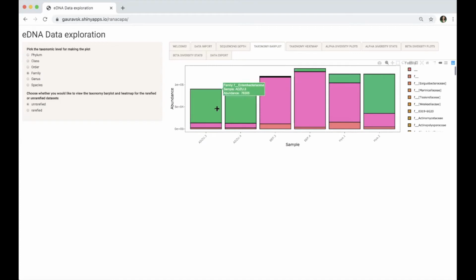But essentially what we see is the same three main types in both of my Adzukis, and they're fairly similar in abundance as well. The abundance is quite similar across both. If I look at my black-eyed peas, again, we're dominated here by Staphylococcus. Most of the sequences were classified as Staphylococcus.